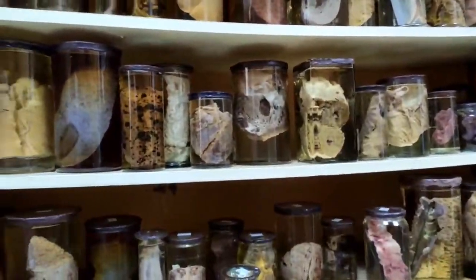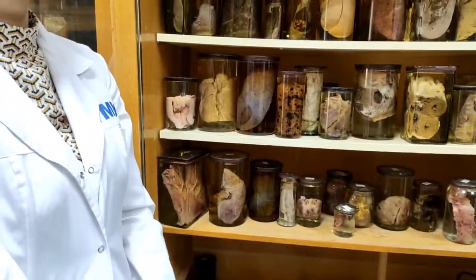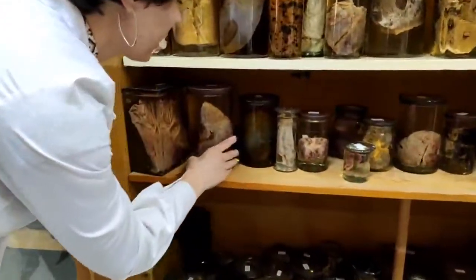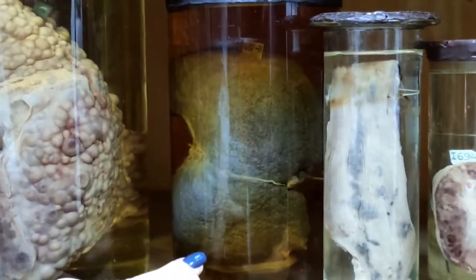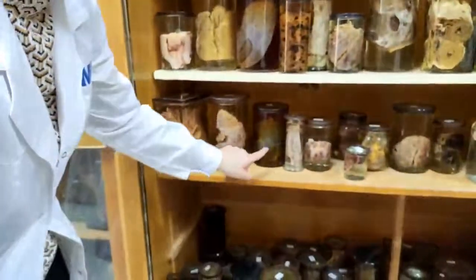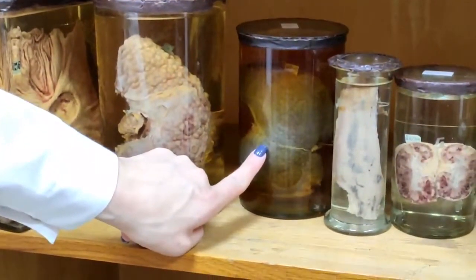Cirrhosis can be divided by the size of the nodules as macronodular or micronodular. Macronodular cirrhosis means that these nodules are more than 3 millimeters in diameter. Micronodular means that these nodules are less than 3 millimeters in diameter. The next one is also cirrhosis, but this is micronodular, because you can see that this liver has a granular surface, and it is almost not visible that this liver has a lot of nodules. This liver has a greenish or yellowish color because this patient has jaundice.